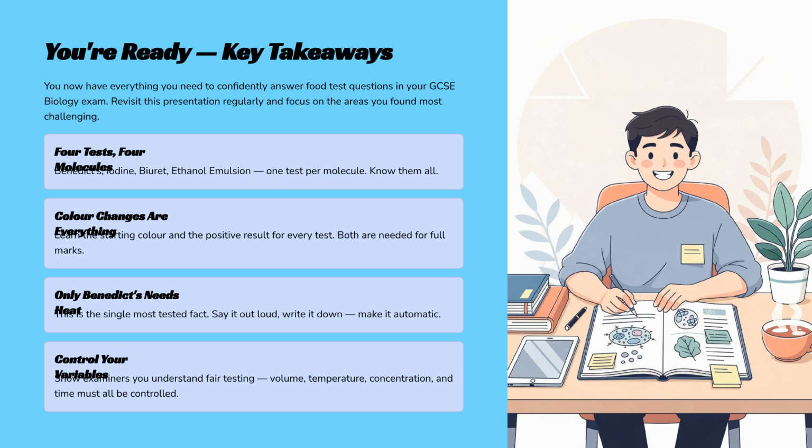You are ready for your exam. Remember, 4 tests for 4 molecules, colors are critical, heat only when necessary, and always control your variables. Review these concepts until they are second nature. You've got this.